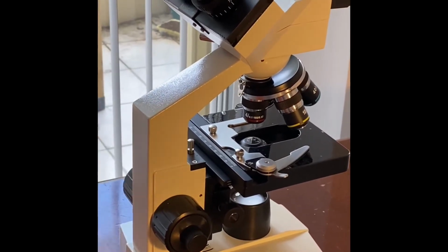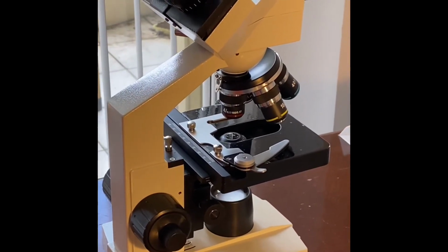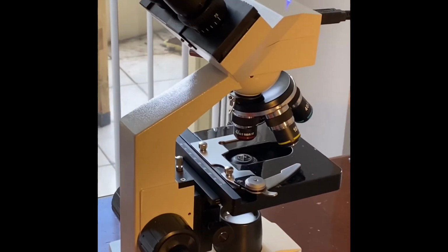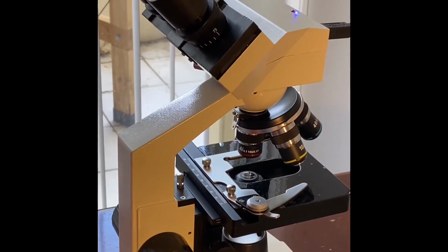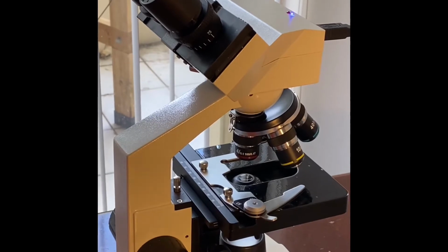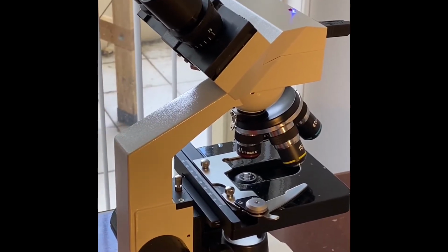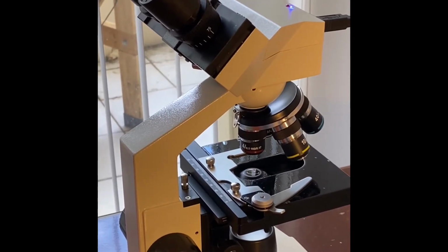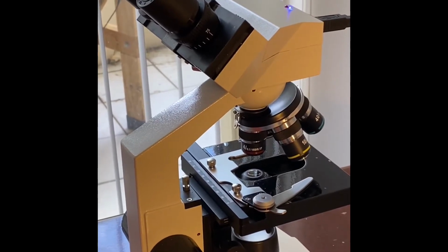We're going to go over the different essential microscopic uses. If you look at the microscope, a common basic microscope should have certain features that all microscopes contain, including your microscope that is monocular.